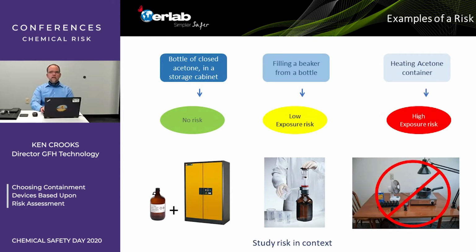And then you could be heating acetone, and this obviously, being a flammable chemical with a very low flash point, is a very high exposure risk. And God love the internet, I went out and I searched heating acetone, and this is one of the very first photos I found, and this appears to be a burner on someone's kitchen table with some acetone bought at a hardware store and a fan to blow over it, and it looks like at least they're heating water to then warm up the acetone, but by gosh, this is done on an open bench, so please don't anyone ever do anything like that. Definitely heat it with water, not directly, but I'm not the chemist here, that scared me when I saw that.